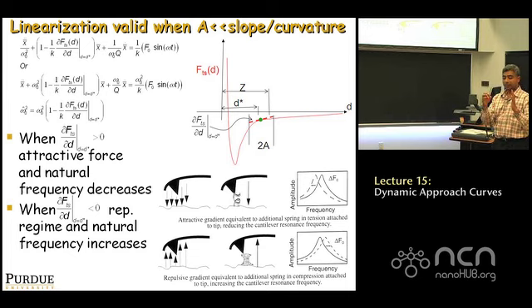So that's the green dot represents the gap, the D star value at which the cantilever has equilibrated, right, from the sample. And what one is basically doing is writing the tip sample interaction force as a Taylor series expansion. The first term of the expansion is basically the slope of the interaction force at that point, right? That's the first, and the slope of the interaction force is partial F partial d.